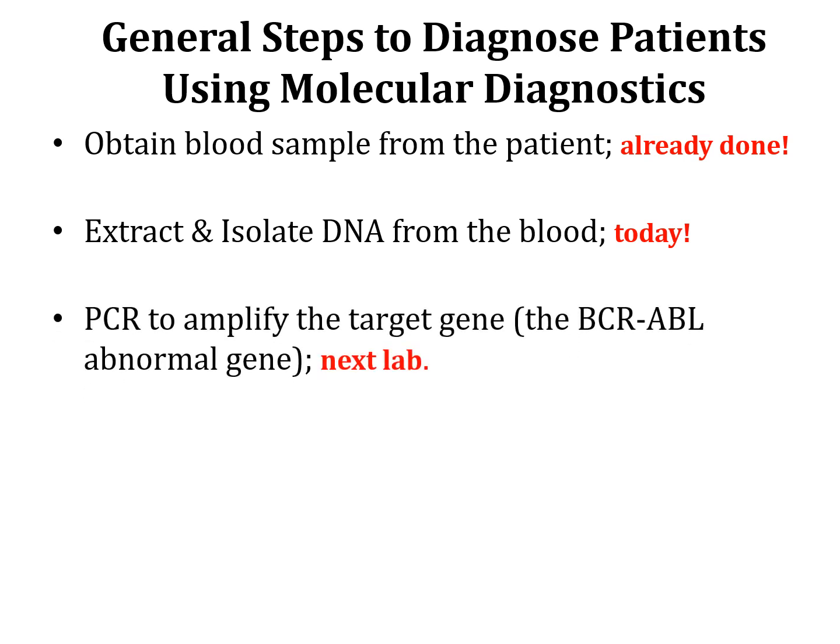And then for the next experiment, experiment number 6, we're going to check for the presence of the cancer gene. So this is the abnormal CML type leukemia. We're going to use PCR. We'll learn about PCR in the next class to amplify this target gene. We're going to be using PCR to amplify the target gene to see if it is present or not. Remember, guys, this is a hypothetical example. We're just doing this as an example. It's more complicated than that.